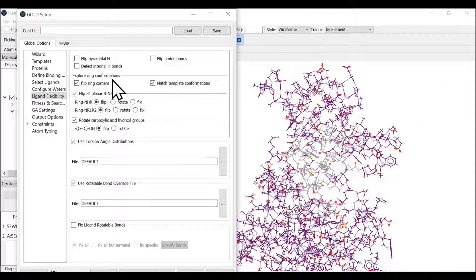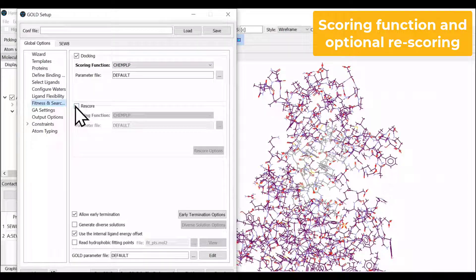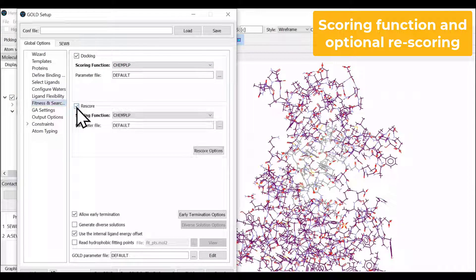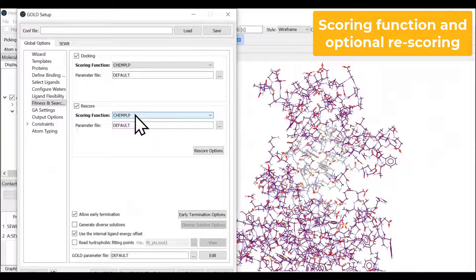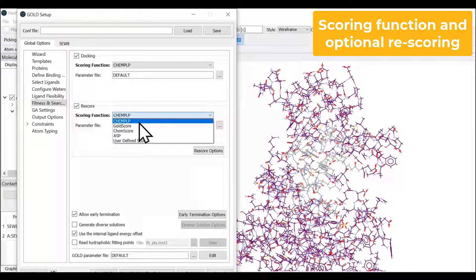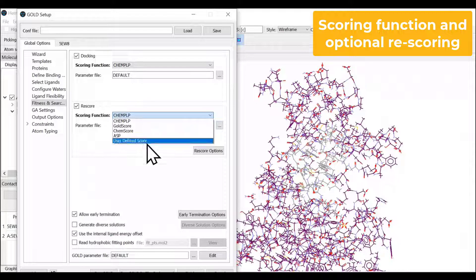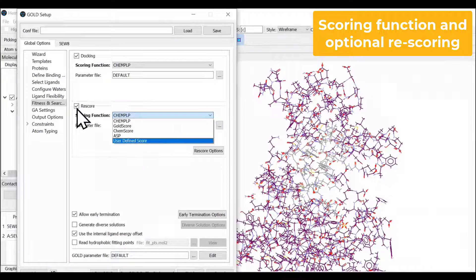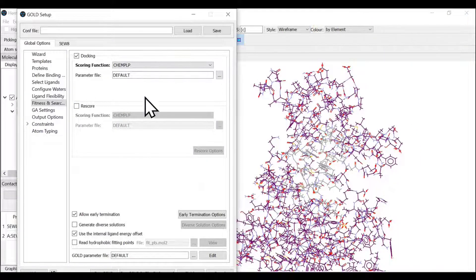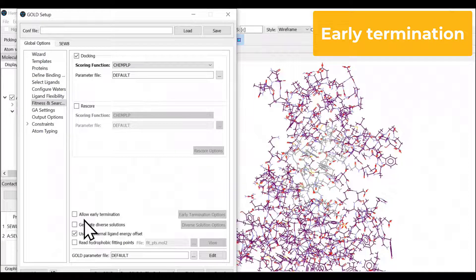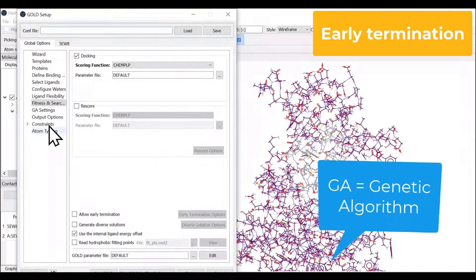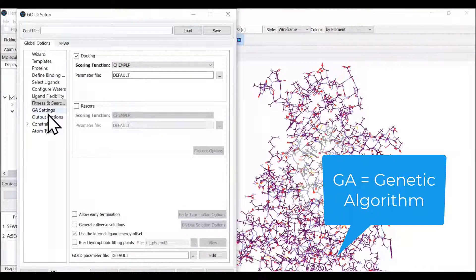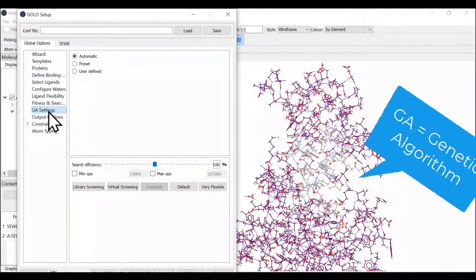For fitness, we have selected ChemPLP. We also provide an option of rescoring. You can select any two different combinations from available scoring functions or your own user-defined function. We will not use this today. We're going with ChemPLP only. We can also select do not allow early termination since we want GOLD to perform all 10 steps we selected in GA settings.